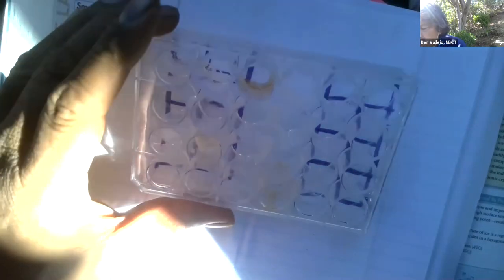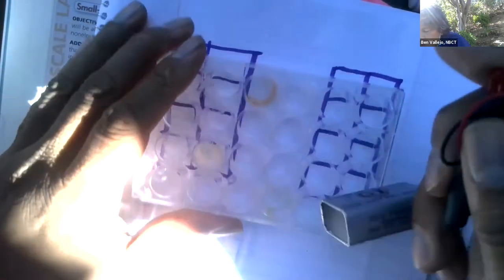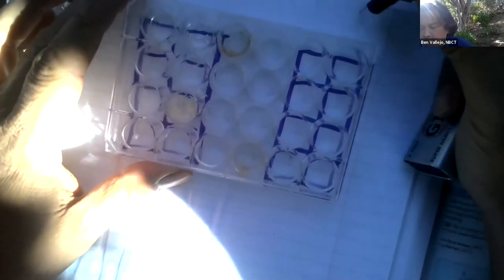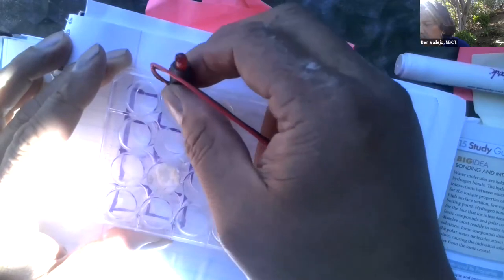So salt does dissociate into electrolytes, and our conductivity meter shows a red light, so that seems to be making ions and conducting electricity. Let's do the second one. Again, watch the light. And what is this chemical? The second chemical is magnesium sulfate. Does the magnesium sulfate dissociate and form electrolytes? What's your guess? Do you think so? I think so. Okay, so let's go. Oh, let's move this back. Whoops, there goes. So red light on that one also.